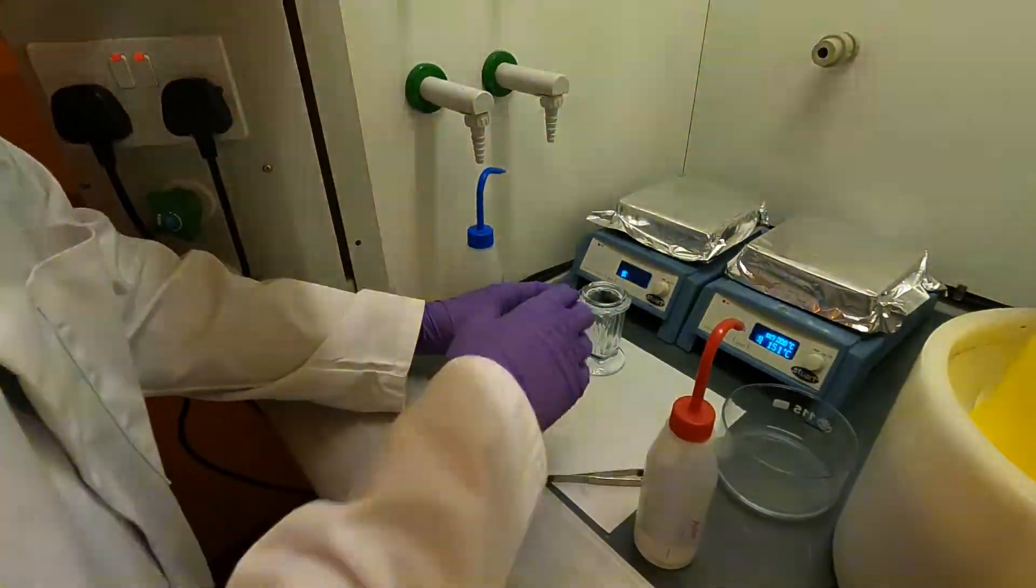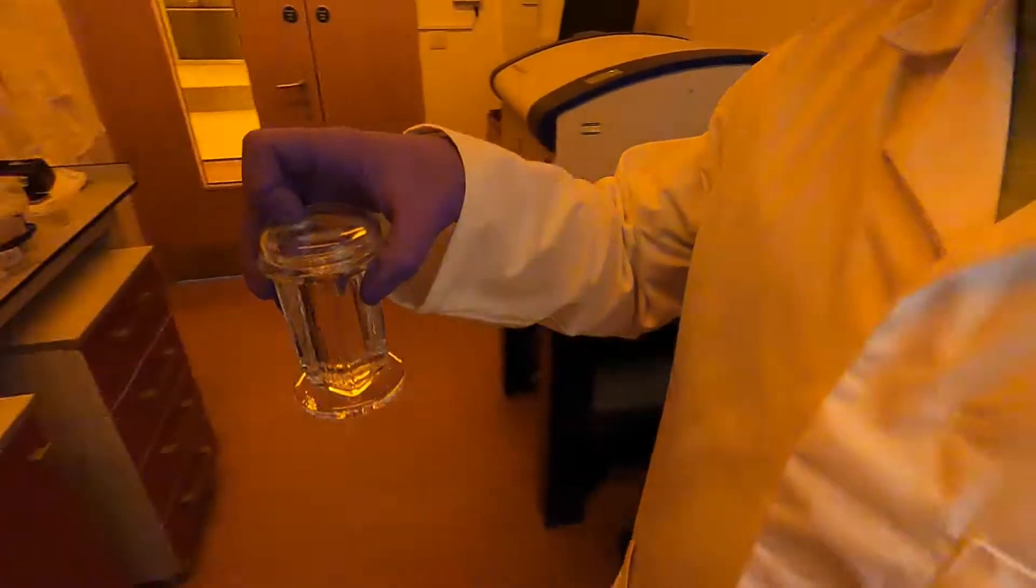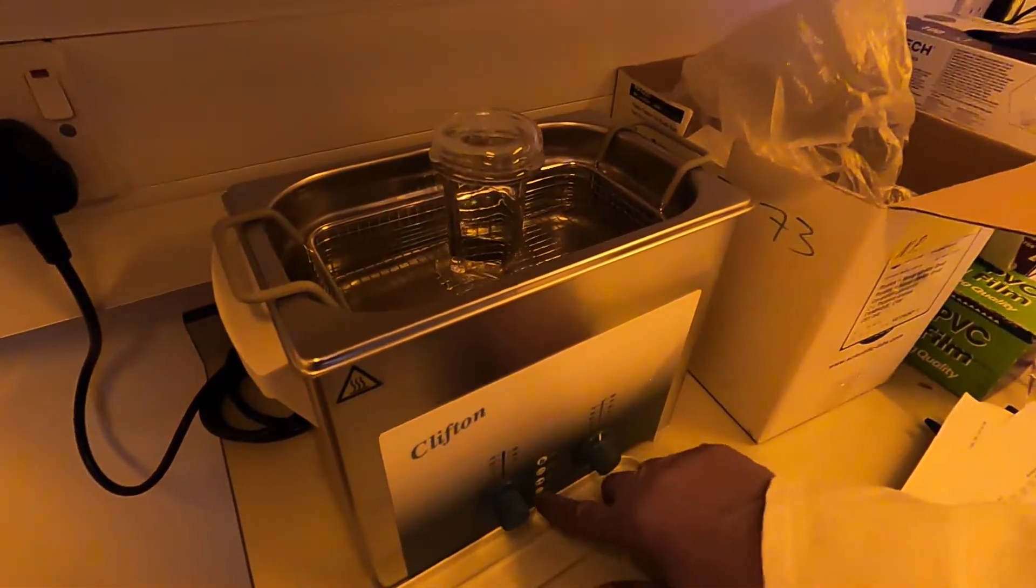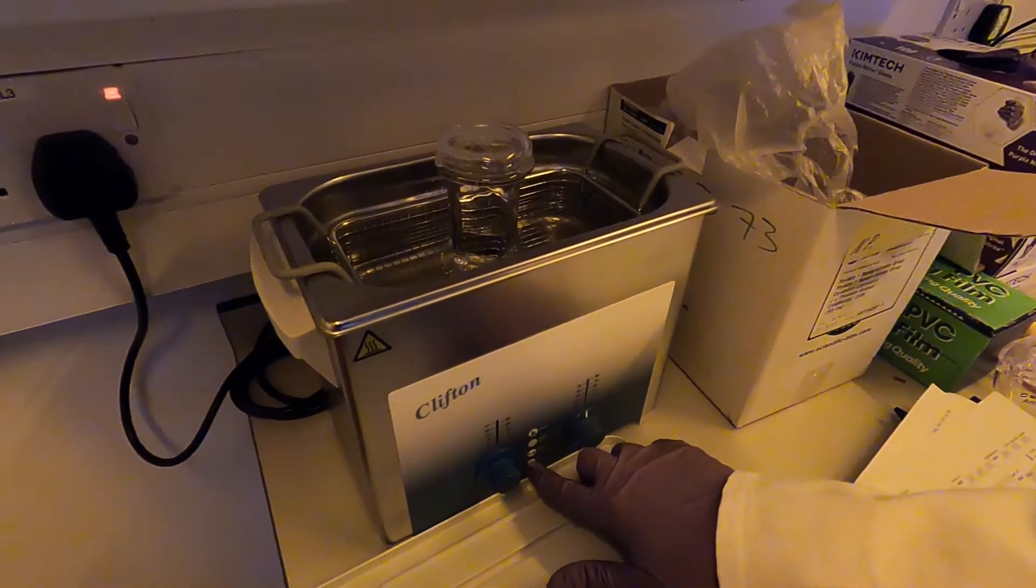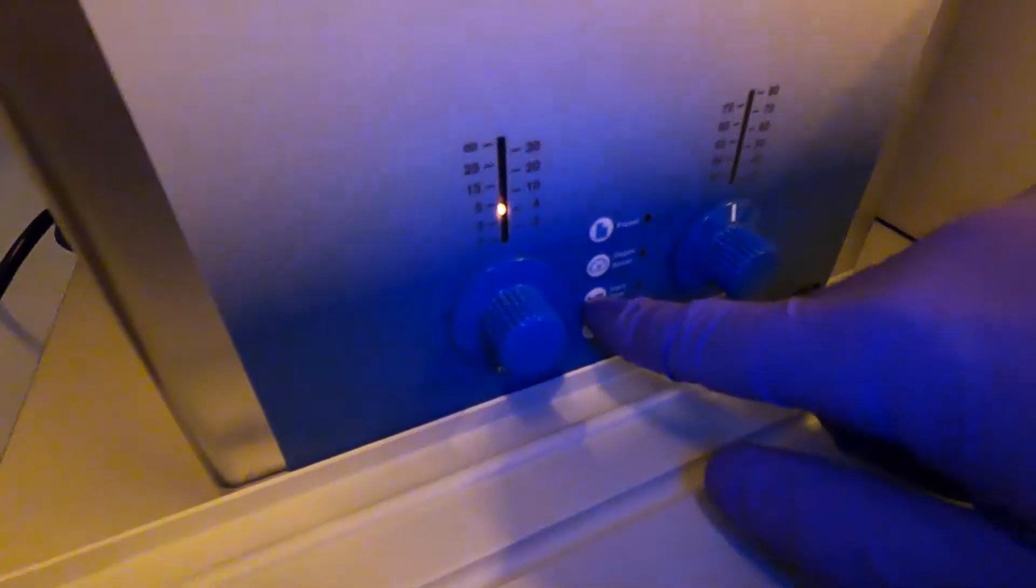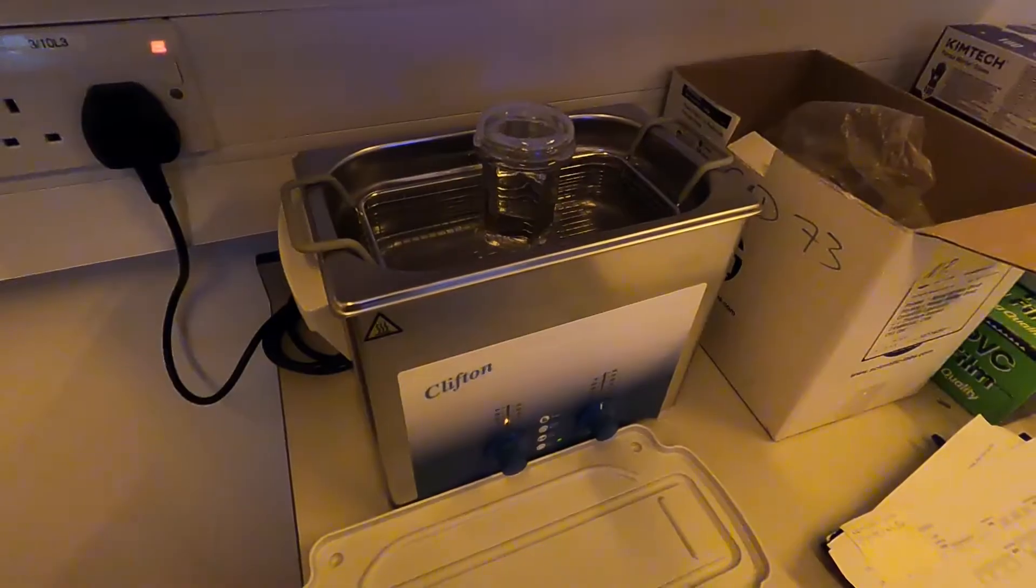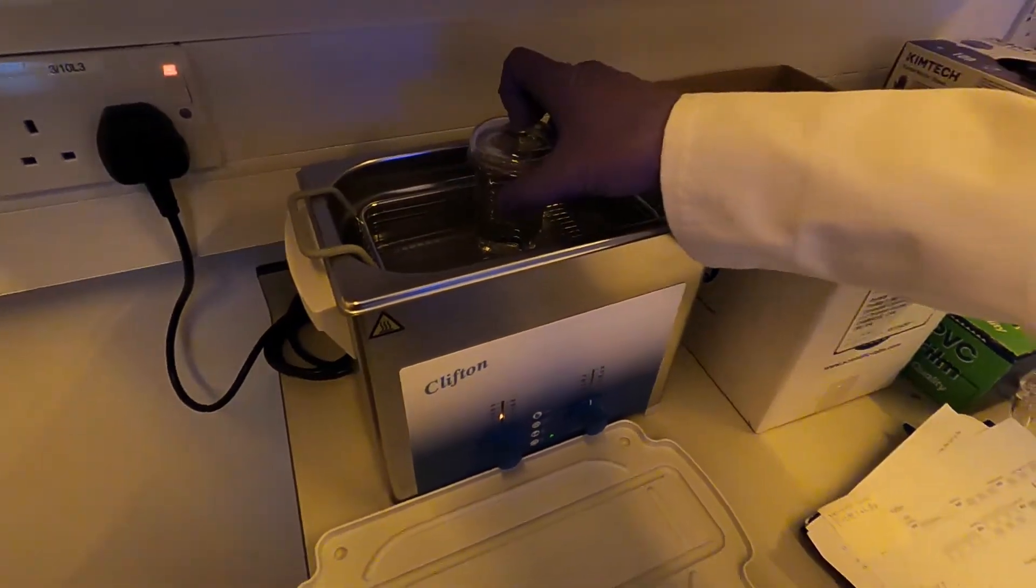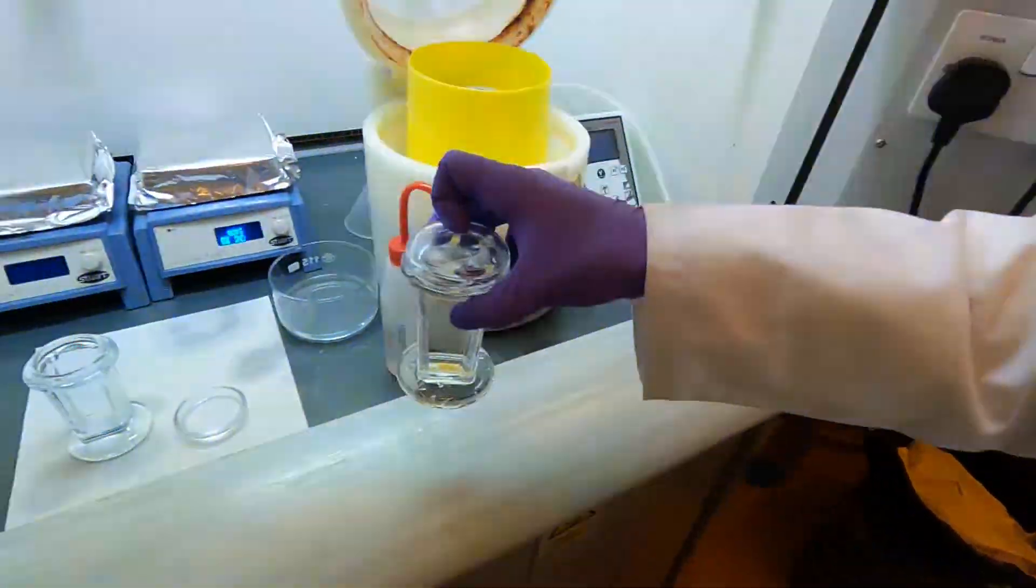Now I'm going to close the staining jar and take it over to the sonicator. I'm going to leave it here to sonicate for five minutes. I'm going to press the start button and that's going to start sonicating. Okay, this has now been sonicating in acetone for five minutes. This is now done, so I can take it out and bring it back to the fume hood.